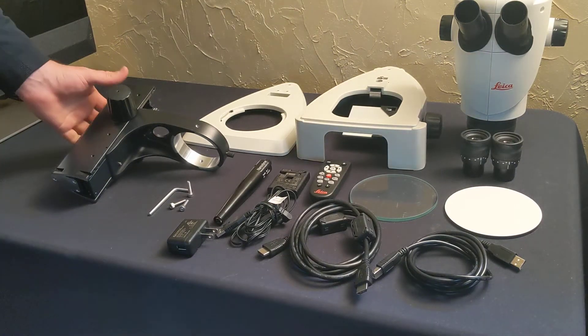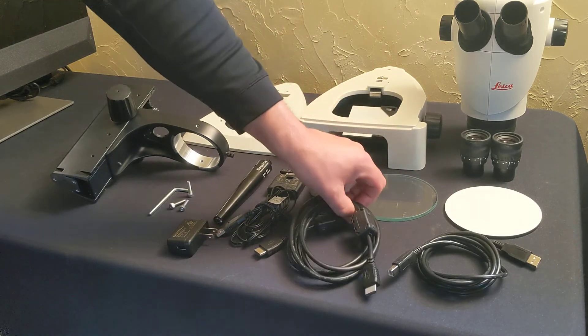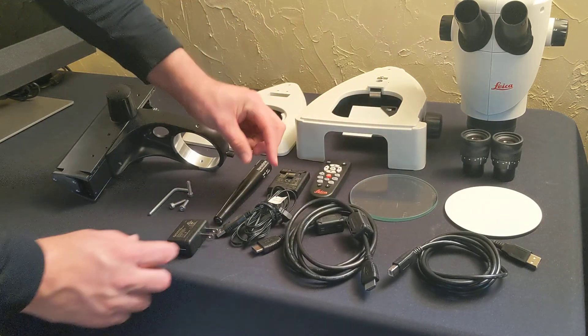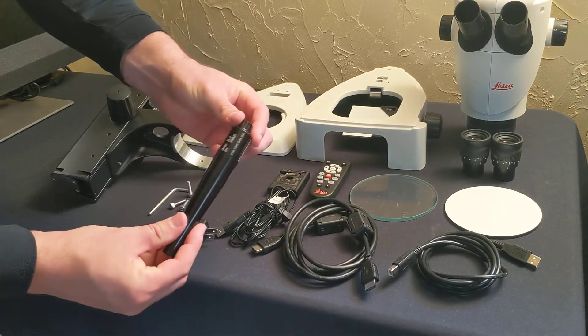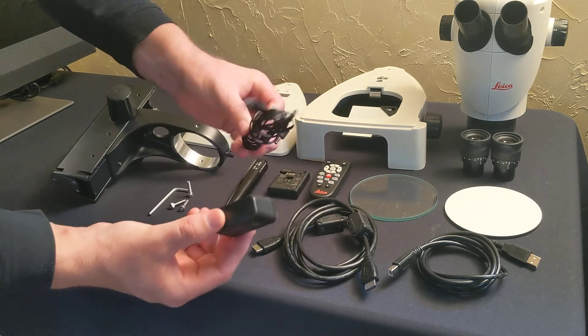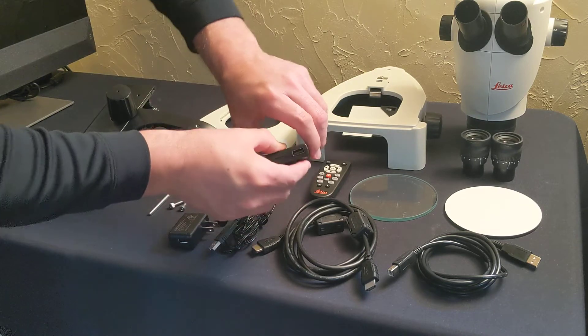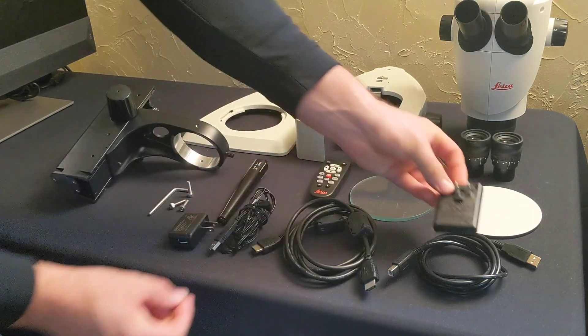Here are all your components. You have the USB cable, HDMI cable, your light source that came separately, along with its power supply and cable, and then the USB power supply for this.